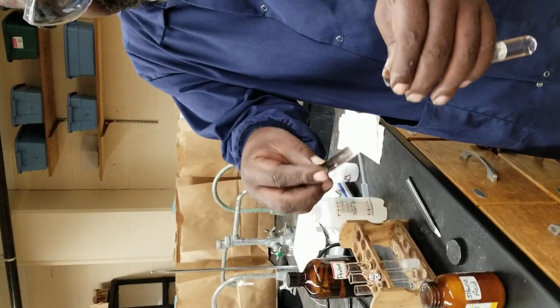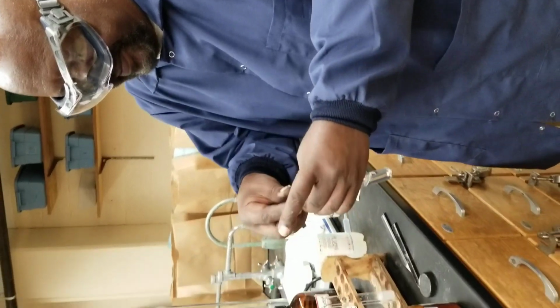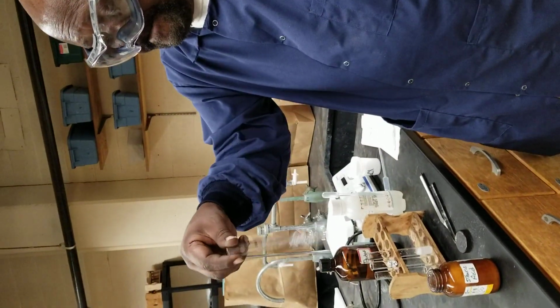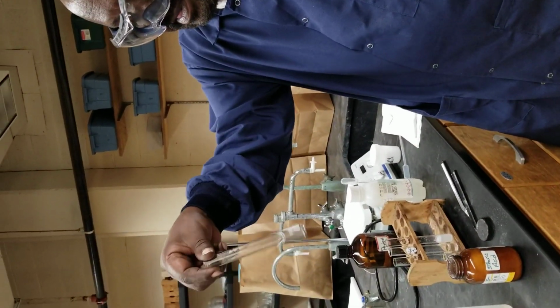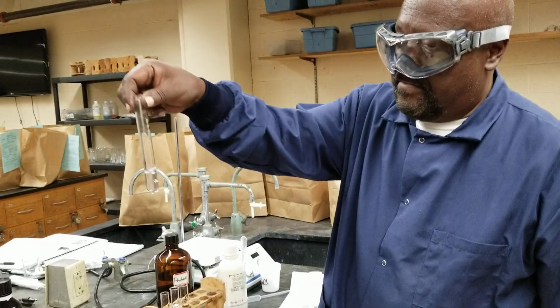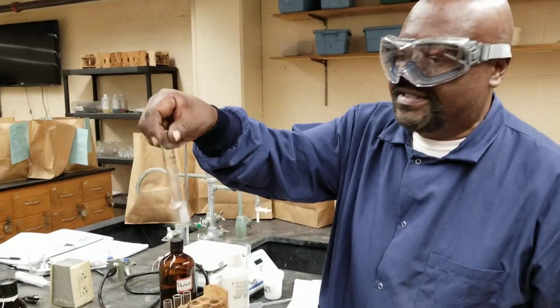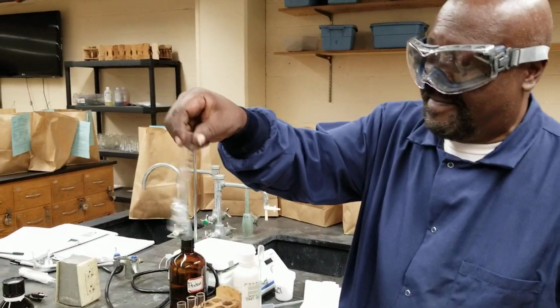Stearic acid. What do you do when we put you in water? Interesting. It's actually less dense than water. Particles float.